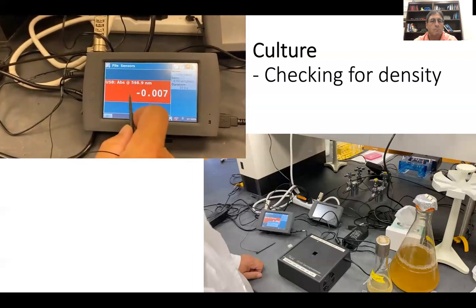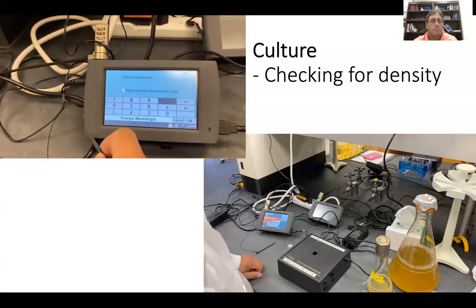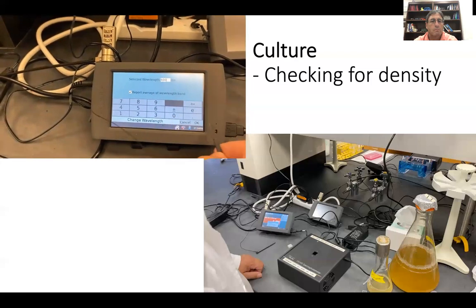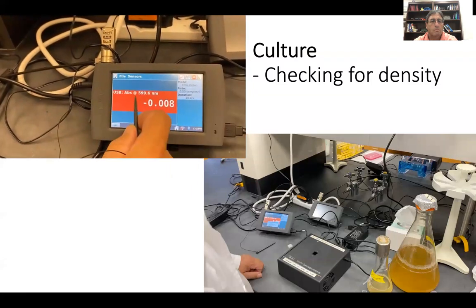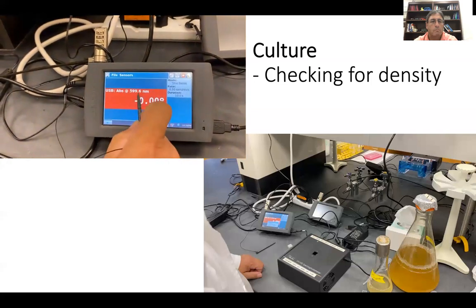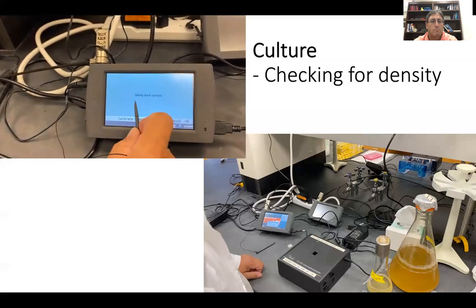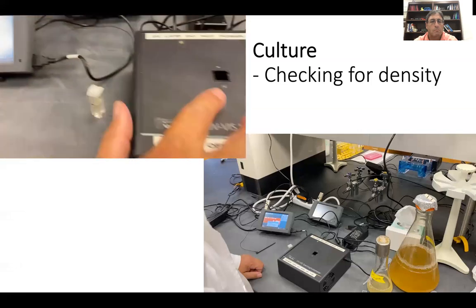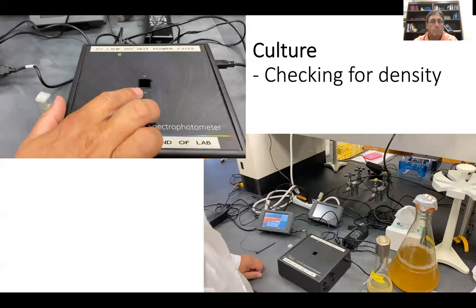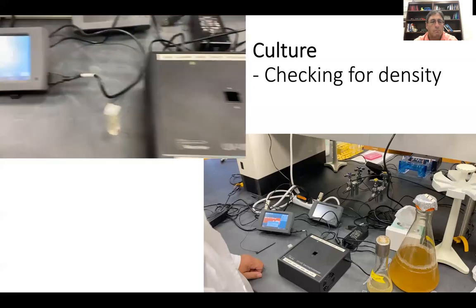Assuming that somebody else had it at a different wavelength, you click in the red area, hit change wavelength, and hit 600. This spectrophotometer will put you to 599.6 based on its grading and filter sets. Then we'll hit this again and tell it to calibrate. It takes the dark sample, and you make sure that there's nothing inside here, although it just shuts the shutter, so I don't think it really matters.